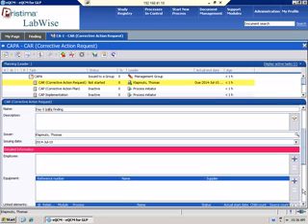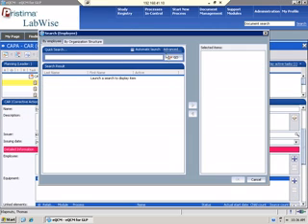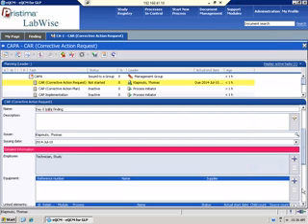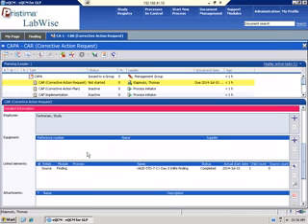So now here, because it's personnel, I can link the employee who was part of the finding. And so here we'll just pick study technician. If there was equipment associated and you have your equipment registered in the system, you can link the equipment. So if it was an equipment failure, you can pull the equipment, which then you can follow up with equipment maintenance.